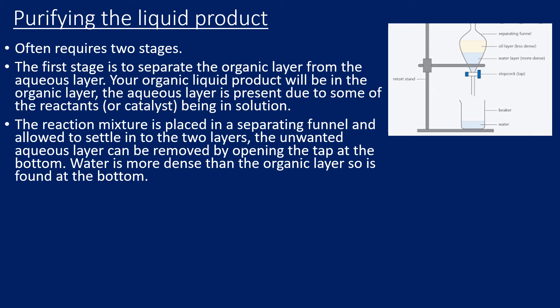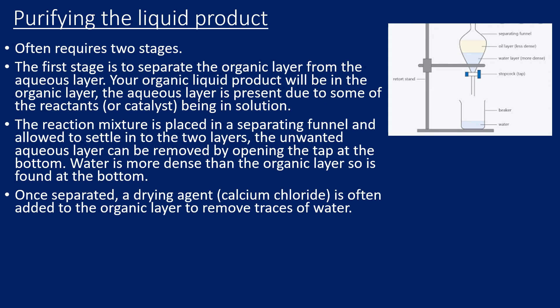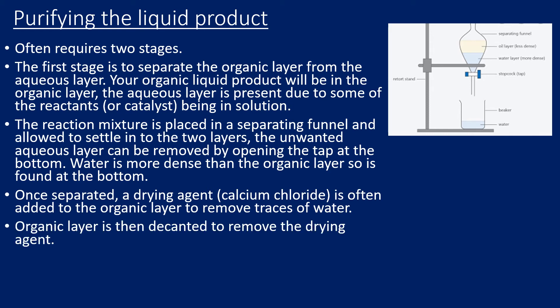At this point, we add a drying agent such as calcium chloride, because there will be traces of water within the organic layer. We add the calcium chloride to remove those traces of water. Once done, we can decant the organic layer off, leaving behind the calcium chloride. We now have a dry crude product.